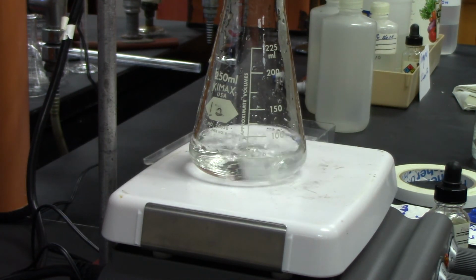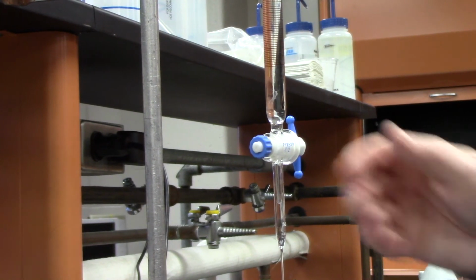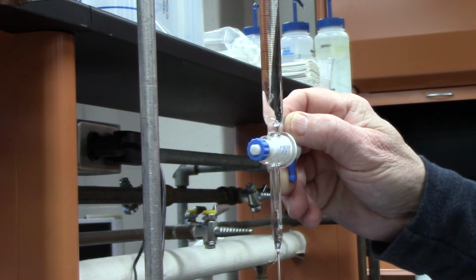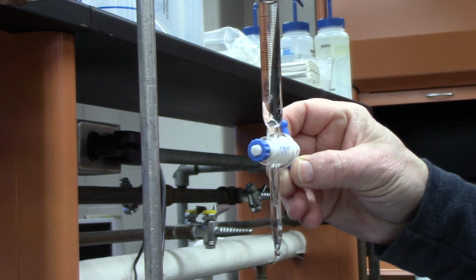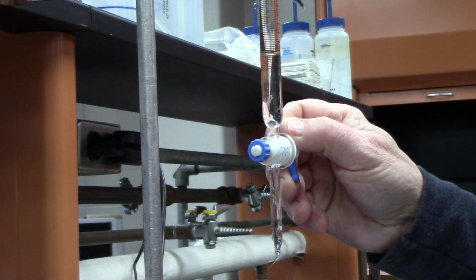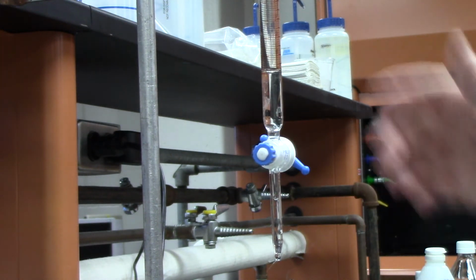It should almost go all the way, if it's anything like the last one, hopefully it will. I'll let it go down to 50. When it gets to 50 right here, I'll turn it off, and then I'll add some more. You hope your results are reproducible or pretty close. So hopefully it's the same kind of thing we did before. I'll let it go down to 50. It's right there, and I'll show you that it's not turned pink yet. Okay, 50. It's at 50, and it hasn't turned pink yet.